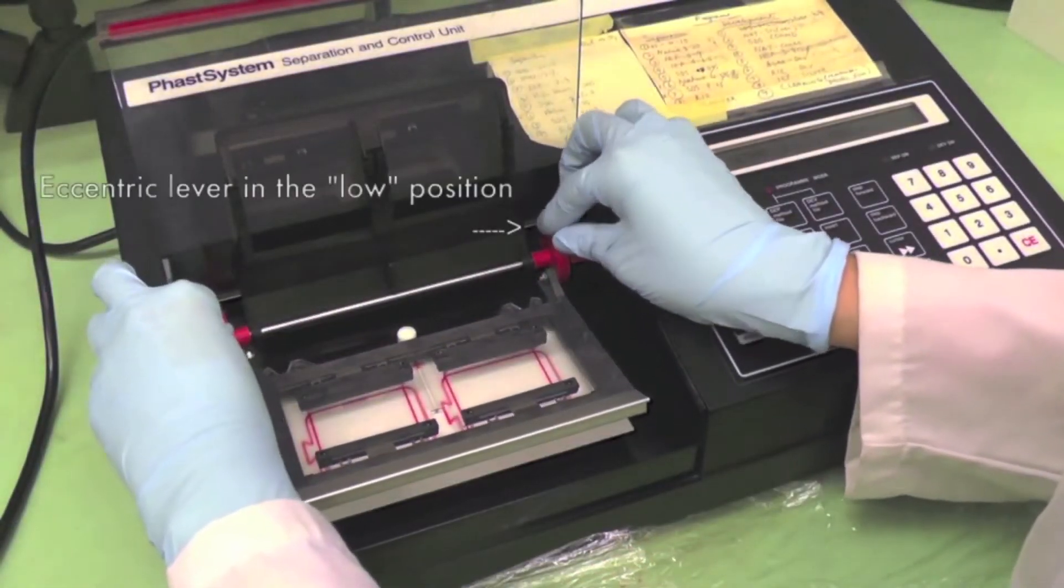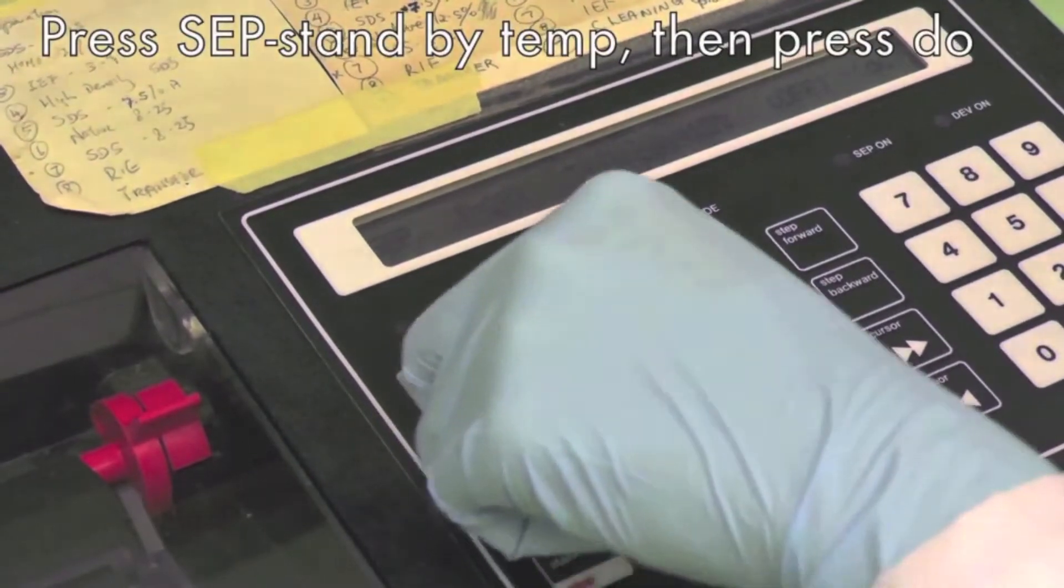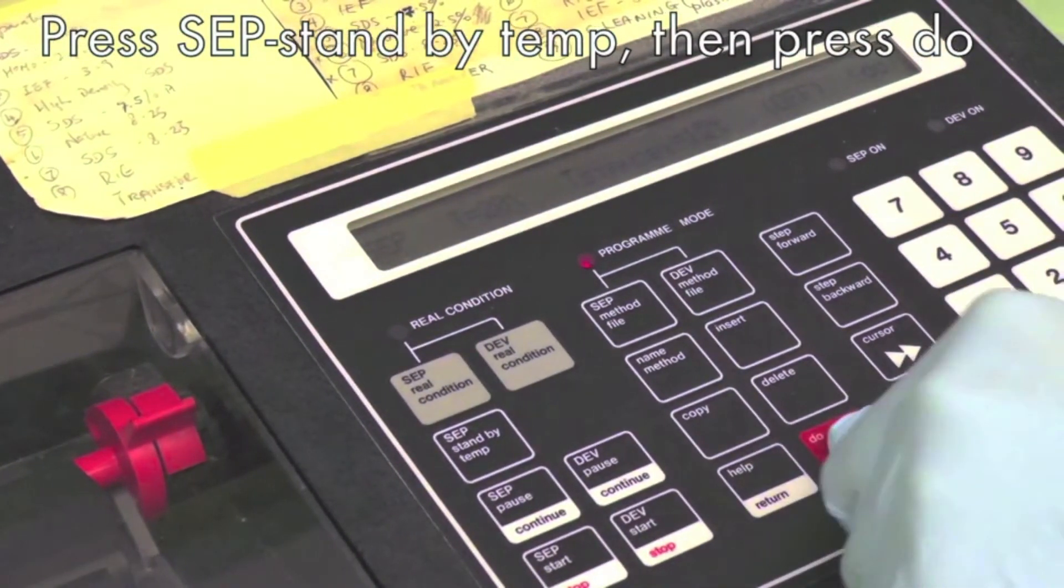For IEF PAGE, the eccentric lever should be at the low position such that the electrode can lay flat on the gel surface. Press the standby temp button and press do to cool the gel bed.